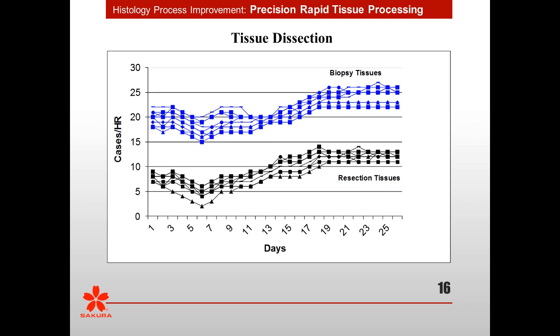Now, think of the possibility of opening up a colon resection, rinsing, and without fixation, you get to see the discolorization, the changes in colorization, the change in tissue. You can place that fork wherever you want to take that sample and quickly take that and get a very precise sample with little variation without having that long process. Certainly you'll go back and fix the rest of that tissue, and you'll fix that sample before you move it on, but it allows you to have a different perspective for samples like that.